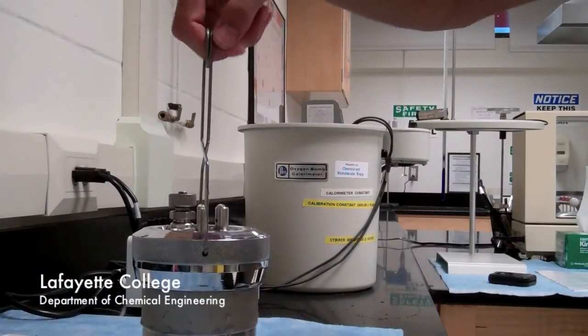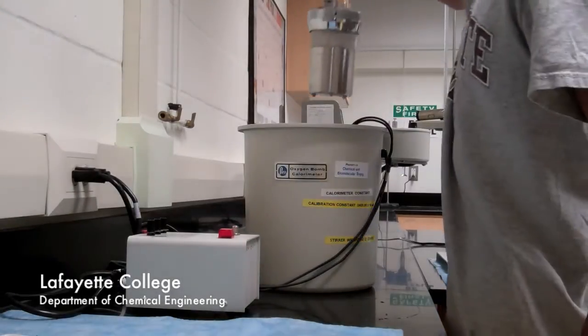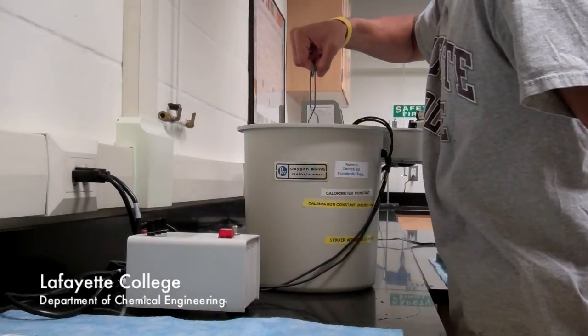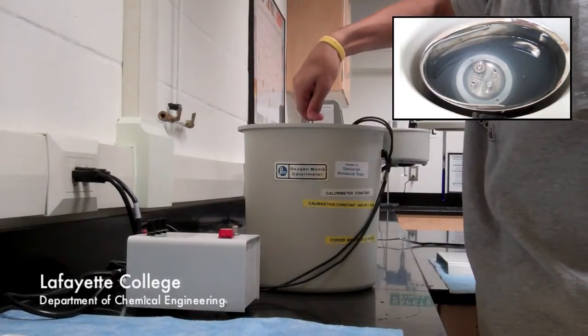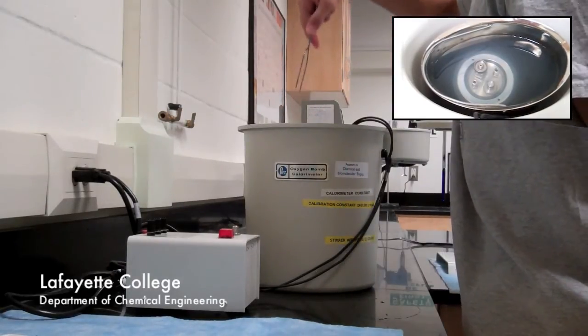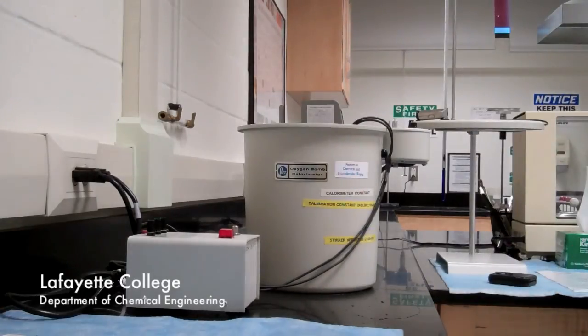Remove the oxygen hose connector and attach the clamps to the bomb. Transfer the bomb to the calorimeter by placing your finger in the top of the clamps. Do not squeeze the clamps together or the bomb will fall. Once the bomb is submerged in the water, remove the clamps by squeezing them together and shake any water on the clamps back into the bucket.